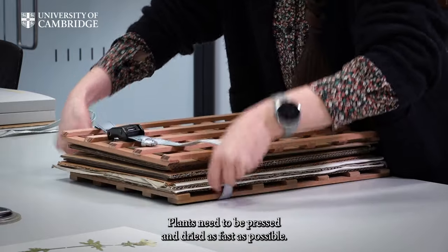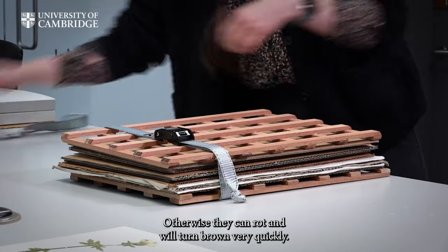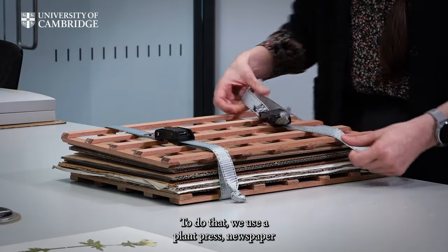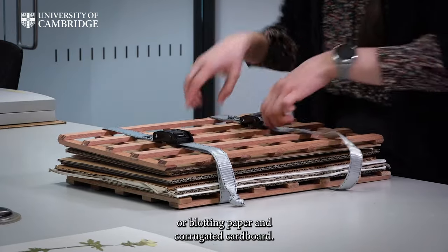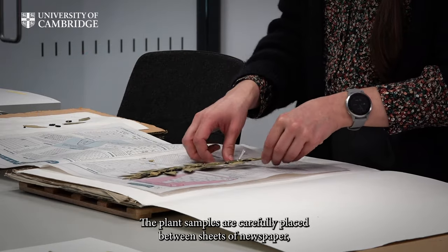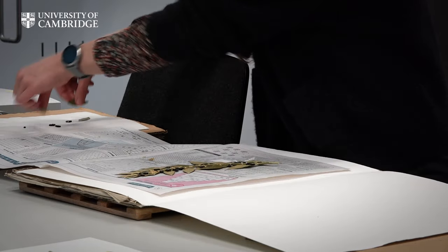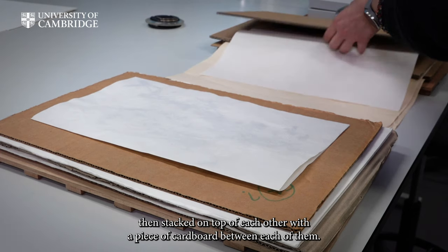Plants need to be pressed and dried as fast as possible, otherwise they can rot and will turn brown very quickly. To do that, we use a plant press, newspaper or blotting paper, and corrugated cardboard. The plant samples are carefully placed between sheets of newspaper, then stacked on top of each other, with a piece of cardboard between each of them.